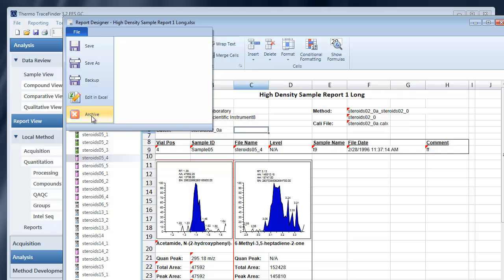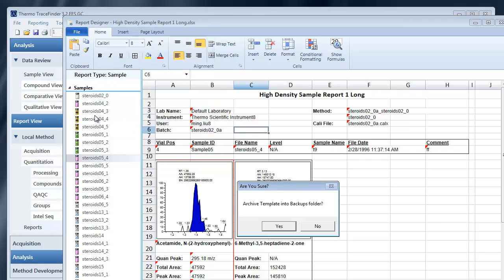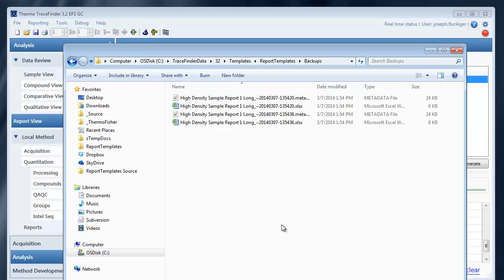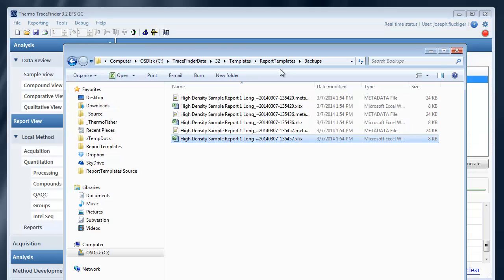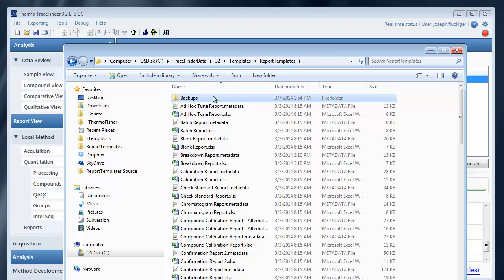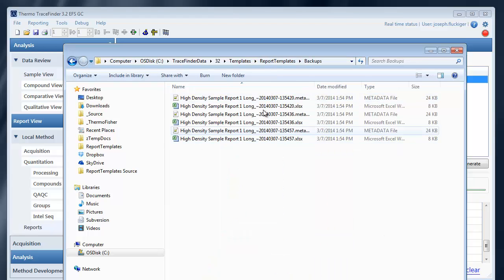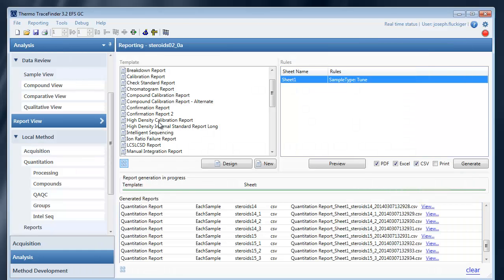Or you can archive the template. Archiving the template will cause the template to be moved into the backups folder as a backup and will cause it to be removed from the available reports list.